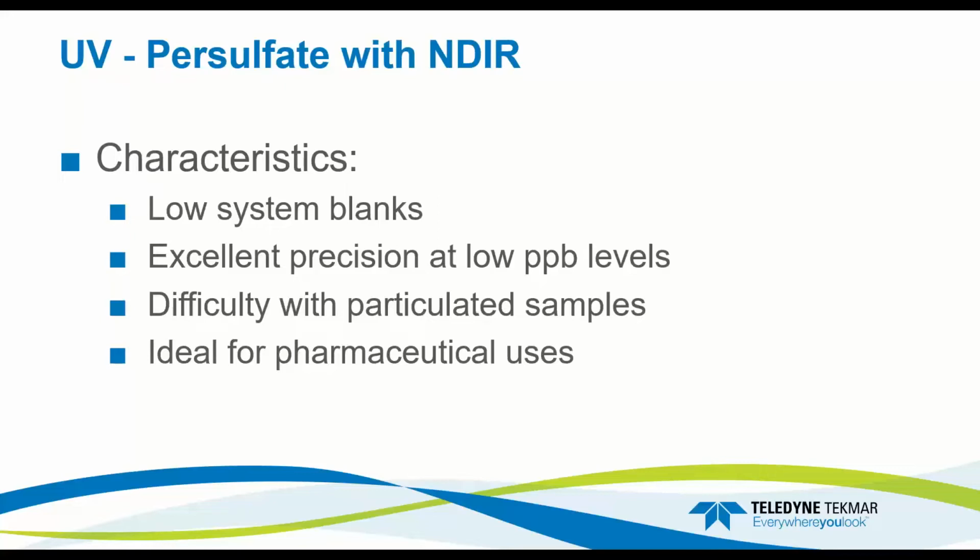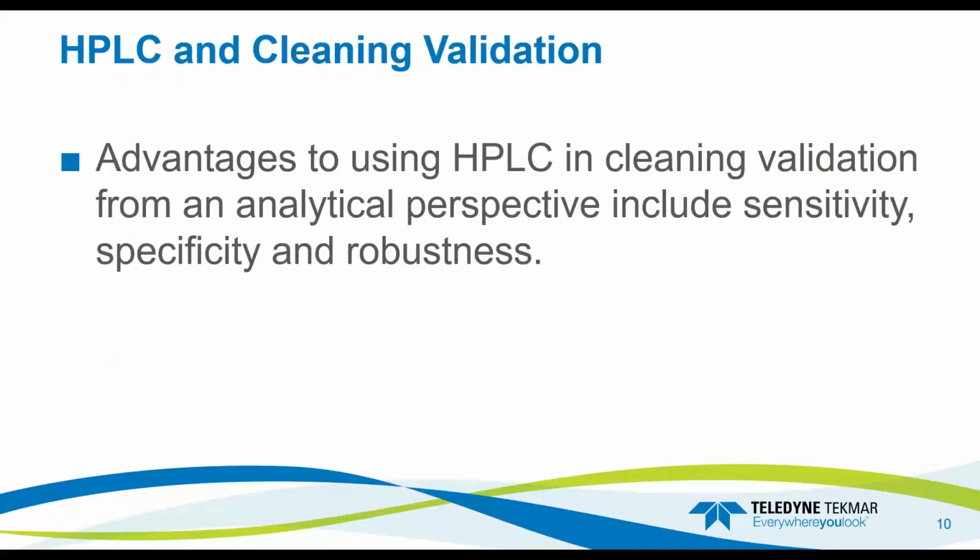So when we start looking at the cleaning validation, there's methods out there, USP 643, where we must do system suitability with 1,4-benzoquinone and sucrose. But there's another aspect that pharmaceutical manufacturers must do. It's also validating that their systems or their reactors or vats are clean. Well, there's a couple techniques out there that they can do this by. The first technique is high pressure liquid chromatography, or HPLC.